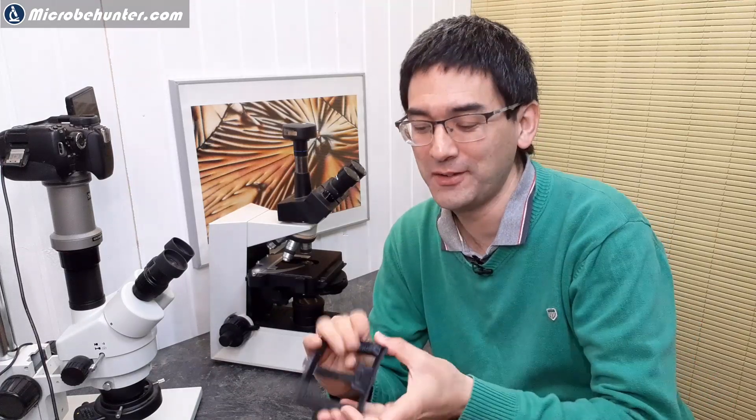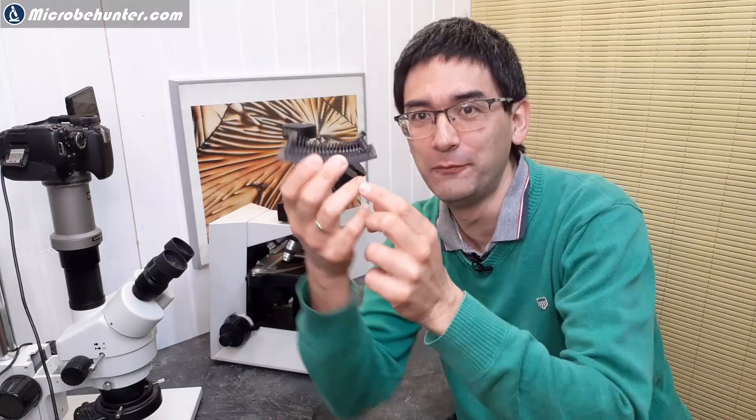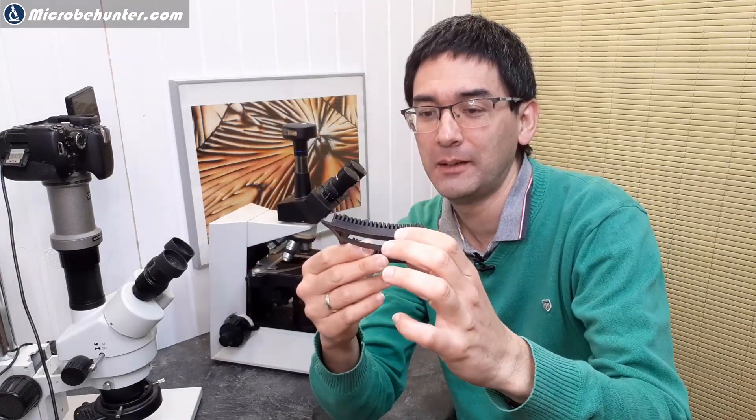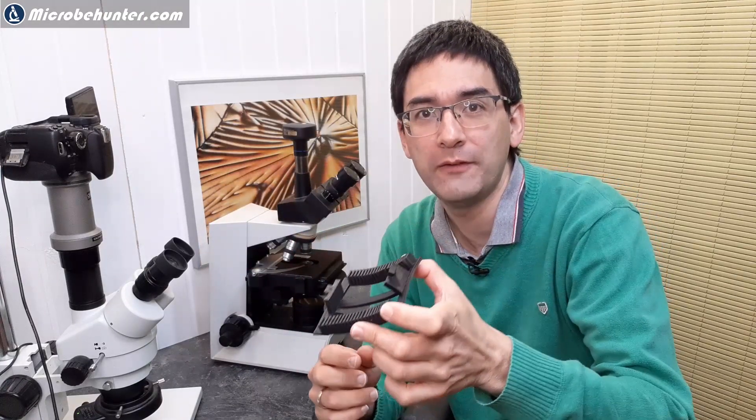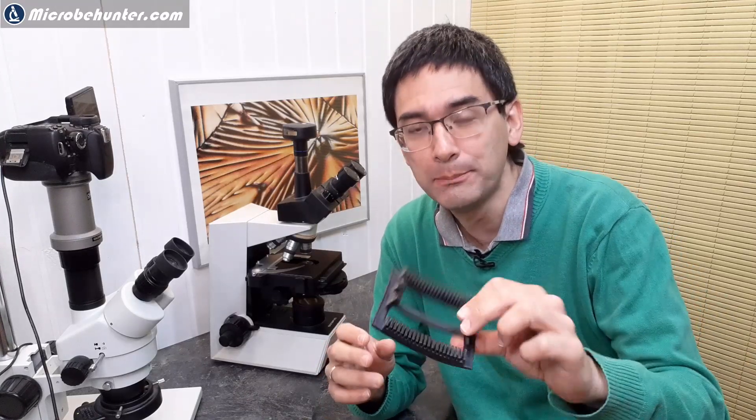Hi, MicrobeHunter here. This is a slide tray that I made — unfortunately a little bit deformed and bent — because I wanted to make a slide tray for dishwashing my used microscope slides, since washing them by hand is a little bit too time-consuming. So I decided to 3D print a slide tray to be put into the dishwasher, and this is the result. I'll tell you what the problems were, and also a solution at the end.